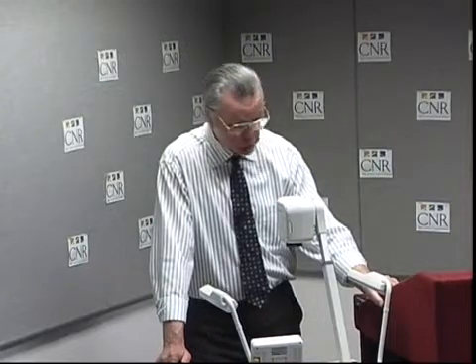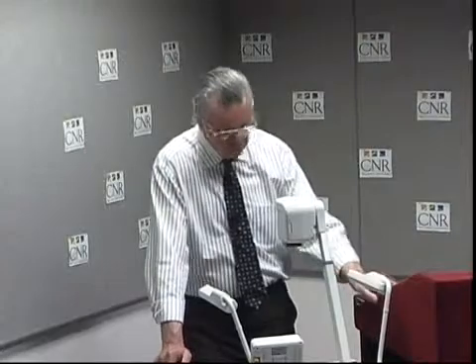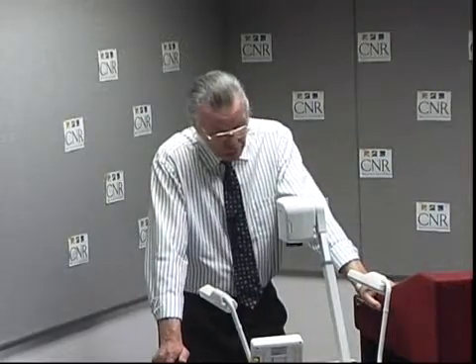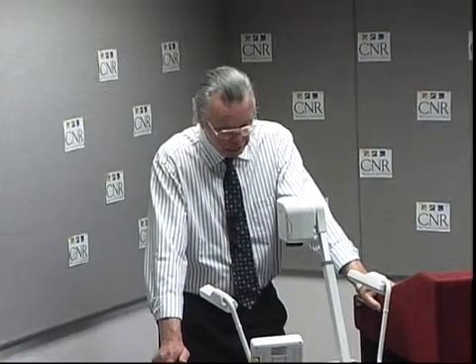So when the mill producing the recycled fiber that has been cleaned will test to 563, or some other method of quantifying the amount of dirt that is present, and certify to the buyer that in fact the stock is to the standard.